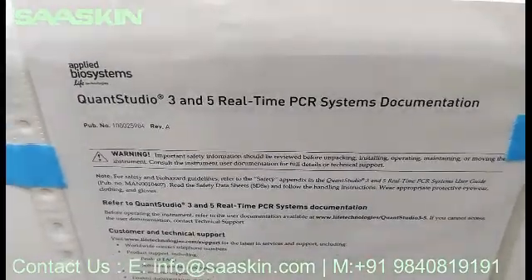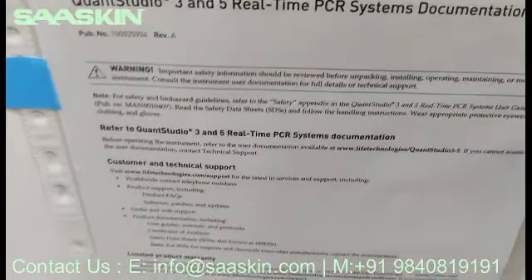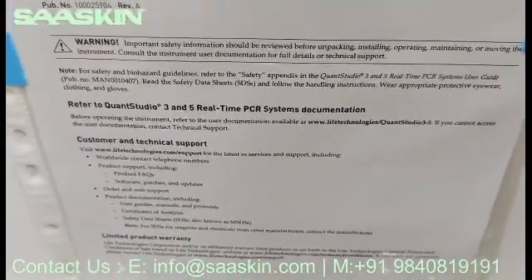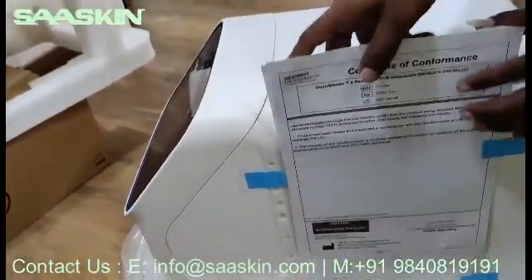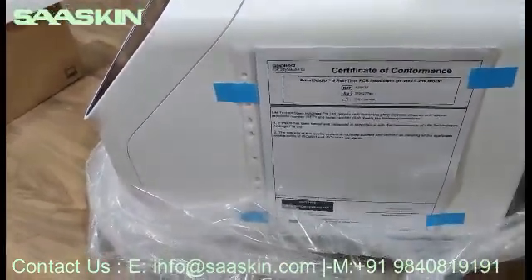You can see QuantStudio documentation details, and you'll have some basic information about customer technical support. This all comes inside the machine. On one side they have put a sticker like this and kept it that way. Let me move to the other side — this is the back side of the instrument.